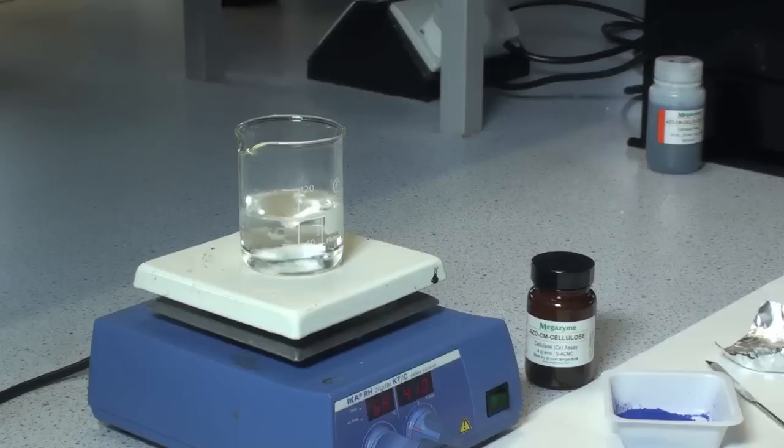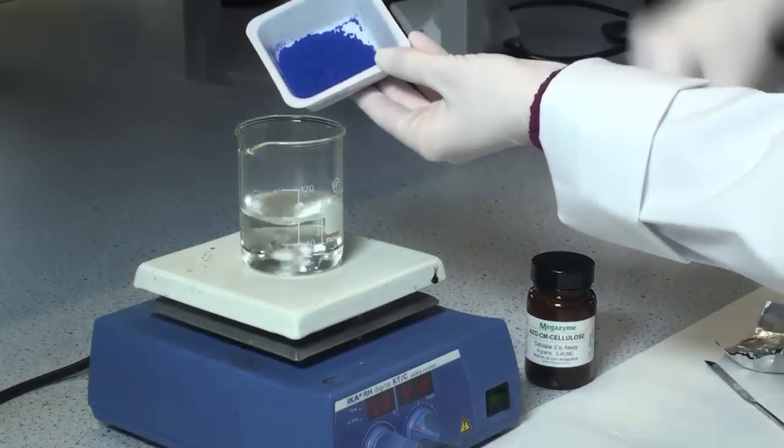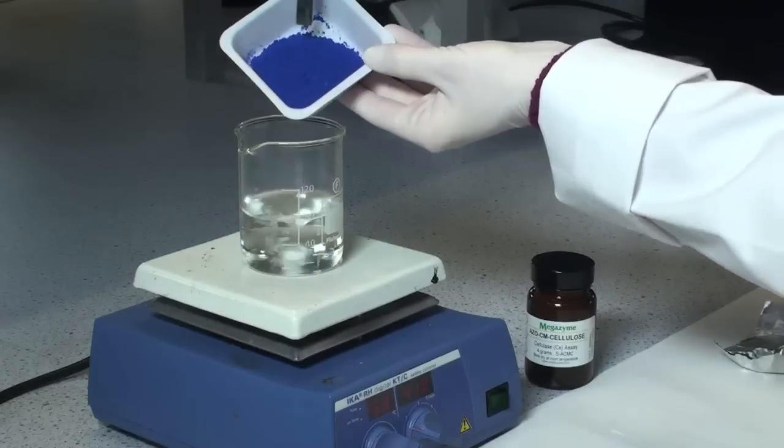Add 2 grams of powdered azo-CM cellulose to 80 ml of boiling and vigorously stirring water on a hot plate magnetic stirrer.